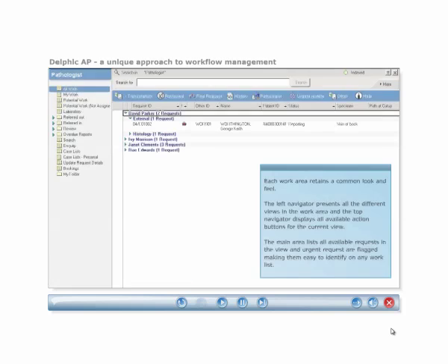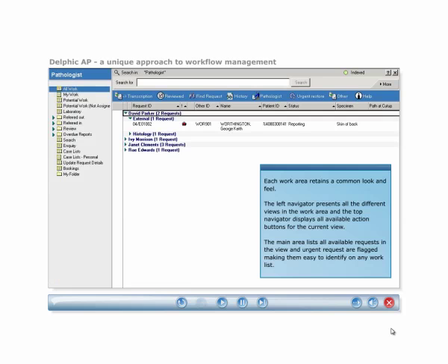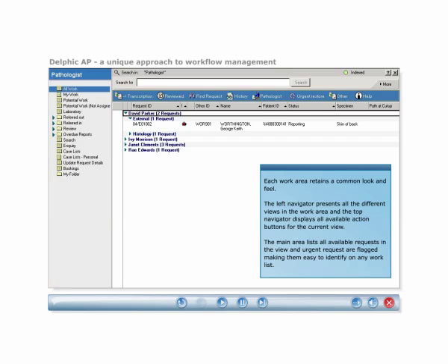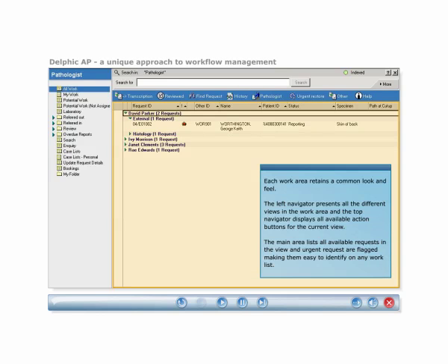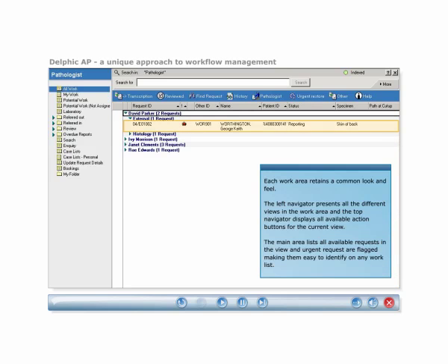Delphic AP retains a common look and feel throughout the application and provides common features to give users a familiar environment when working between different work areas. Within each work area, the left navigator presents all the different views, and the top navigator displays all available action buttons for the current view. In the main area, all requests available in that view are listed and can be sorted by column. Urgent requests are flagged, making them easy to identify on any work list.